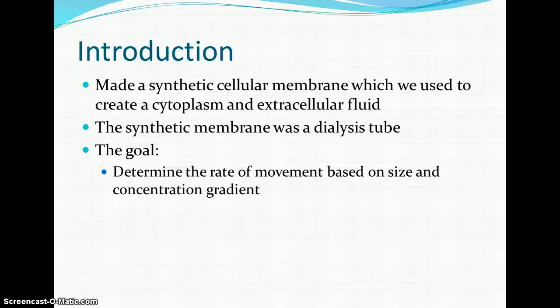So the goal of this experiment is to determine the rate of movement based on size and concentration, and the concentration gradient of molecules. And so to show this, we used a dialysis tube as a membrane to establish basically a synthetic cell and create the cytoplasm and extracellular fluid.